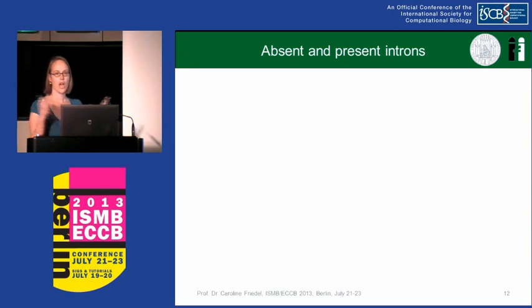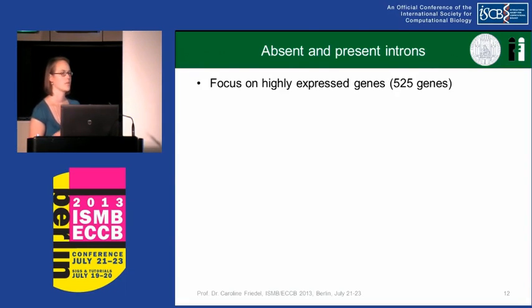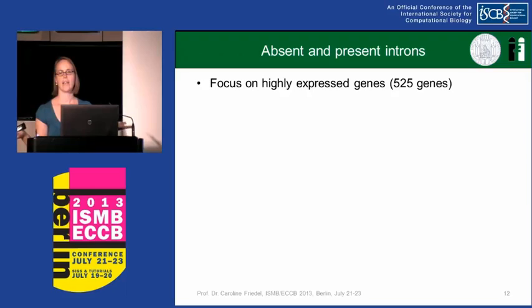So this was a global analysis looking at all introns. What we did then is to look at individual genes, individual introns, but we only looked at the most highly expressed genes, because we need a lot of reads to actually do a reliable analysis. And since even at 5-minute 4SU RNA, a lot of the introns are already spliced at very low levels, we only expected acceptable numbers of reads for these introns if the genes were actually very highly expressed. So this is why we focused on the most highly expressed genes.